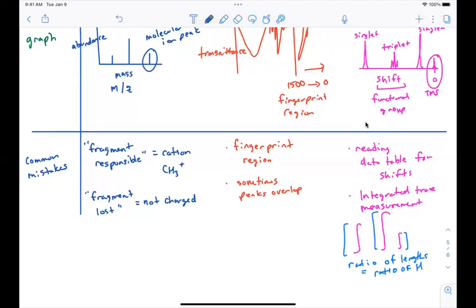Make sure that numbers make sense. Sometimes rounding is kind of weird, but like, let's say this. Let's say your compound has 9 hydrogens, but your ratio is like 1 to 3 to 4. That doesn't make sense. Because 1 to 3 to 4 is how many hydrogens? 8.